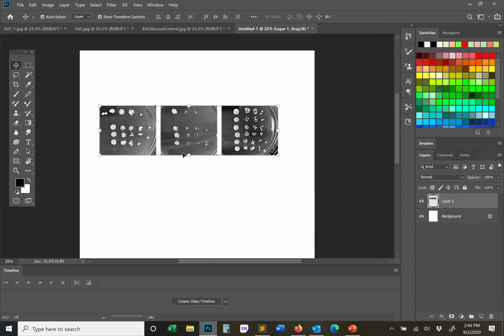I mean, the images that we started with are pretty bad. Like I commented, this thing has glare. Again, you're never going to be able to produce data that looks better than the actual images from which you start. But this to this, much better. And it's much easier for me to see the data.